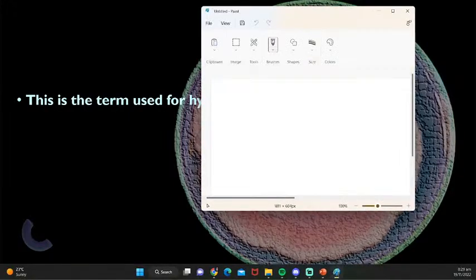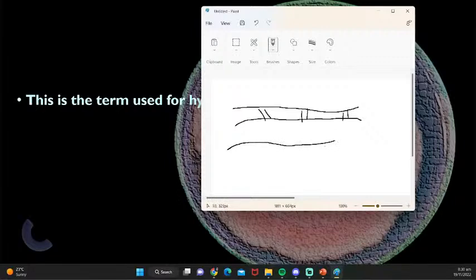So cross walls. So pauci-septate is something like this. So you have a septated hyphae, right? So cross walls, cross walls, cross walls. Right, that's a hyphal branch. Okay, that's one branch of a hyphal strand. Okay, now when you have a pauci-septate hyphae, it looks something like this. Pauci-septate hyphae has irregular cross walls.